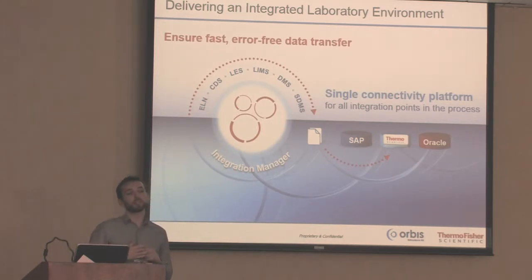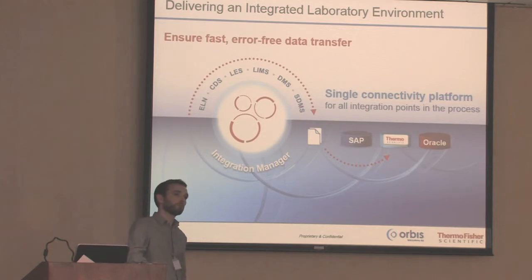want to import that data into? Oh, well, let's say if you wanted to import it into a LIMS, yeah, absolutely. But you said that it's possible to bring data from, let's say, Windows to, I don't know, an Apple operating system or an Android operating system. Oh, at that point I'm actually not quite sure.